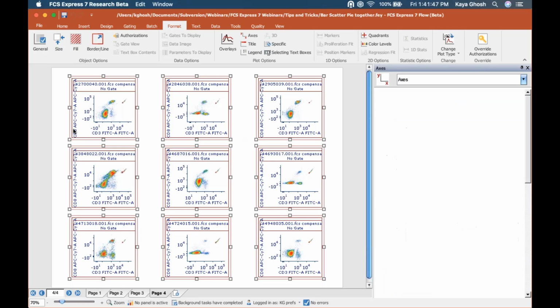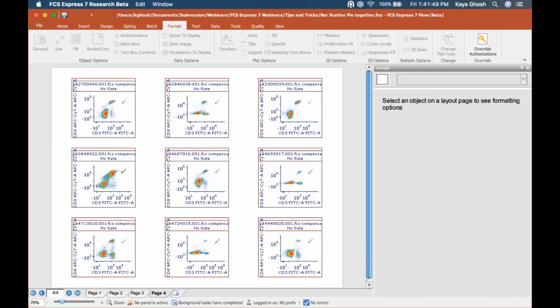And just to highlight what I'm talking about, let me see if I can get my drawing tools to work. Oh, I'm so sorry. On my Mac, the drawing tools frequently don't work. Okay, I can't.